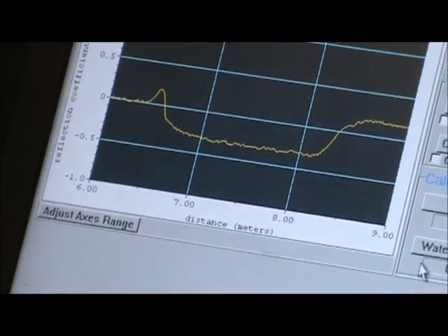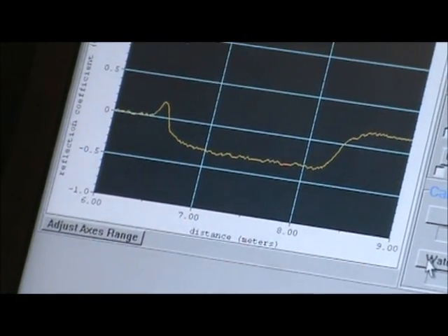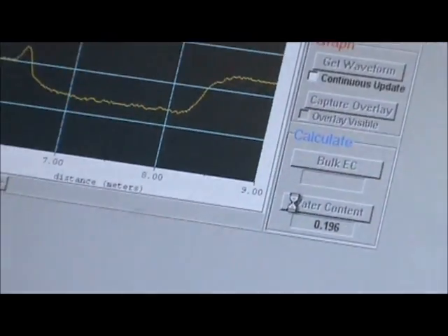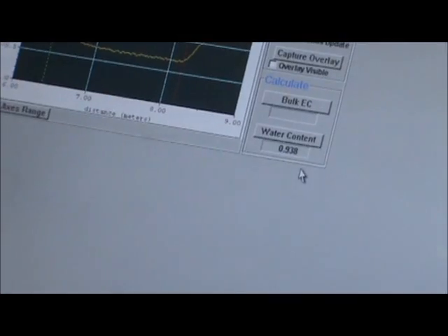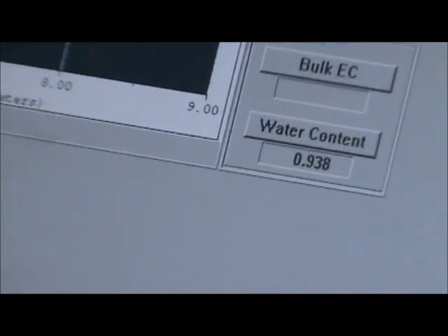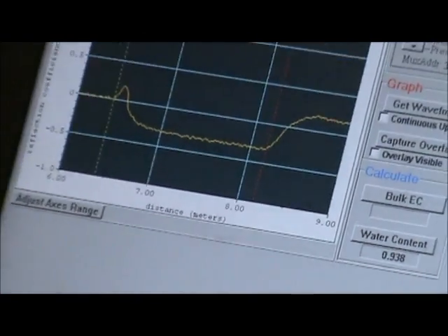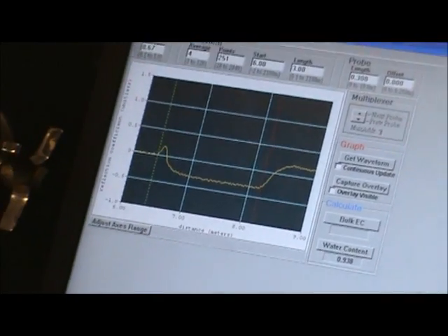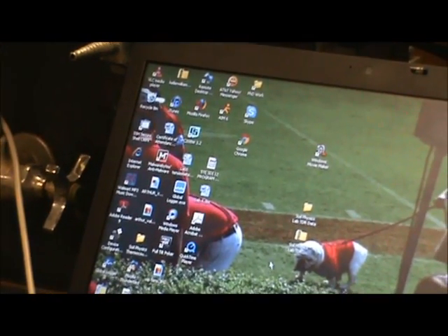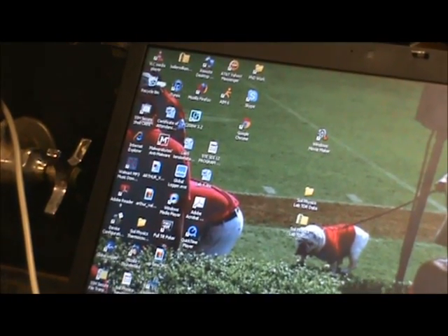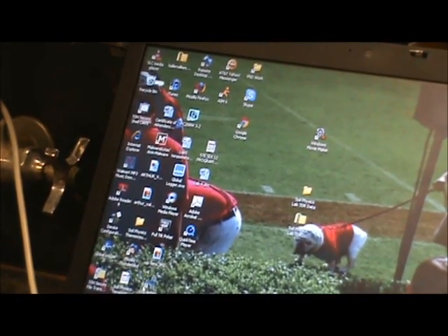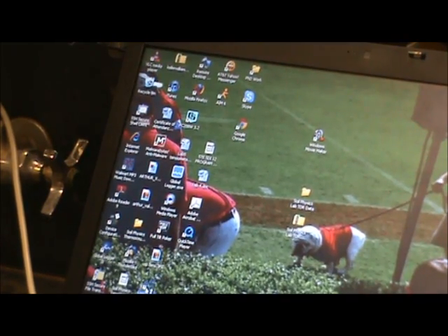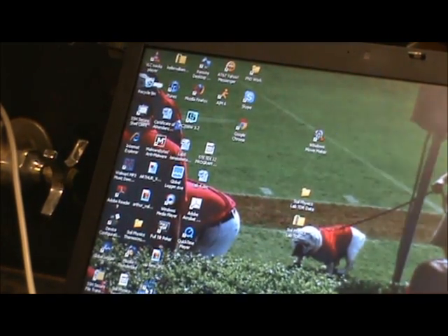We want to calculate the water content. And here we have a water content of 0.938. So that's how we measured the TDR probe water content. And now we're going to switch over to the capacitance probes.